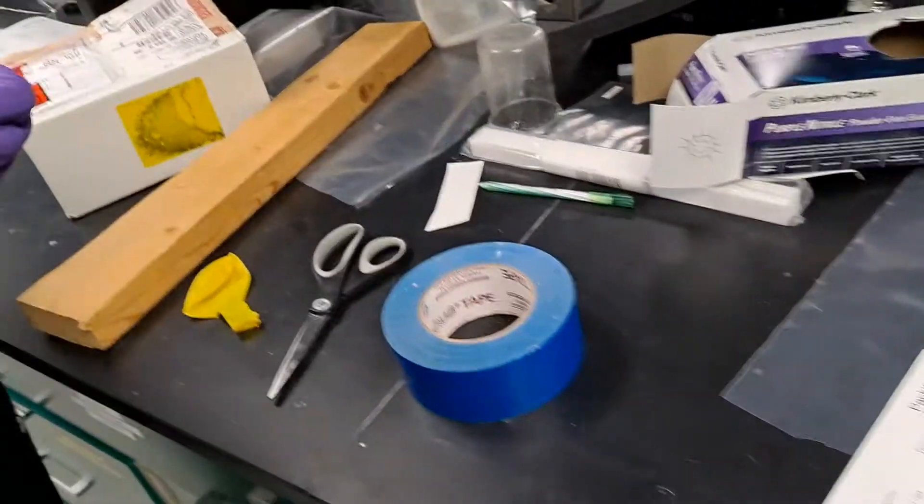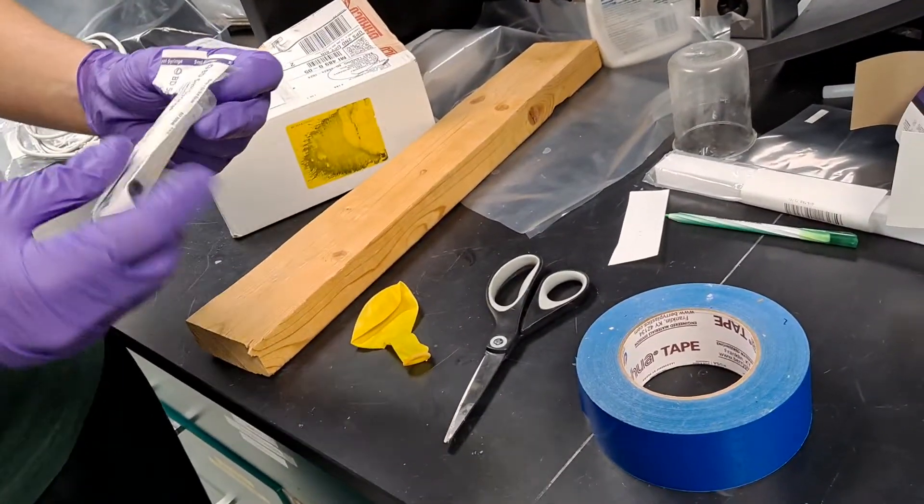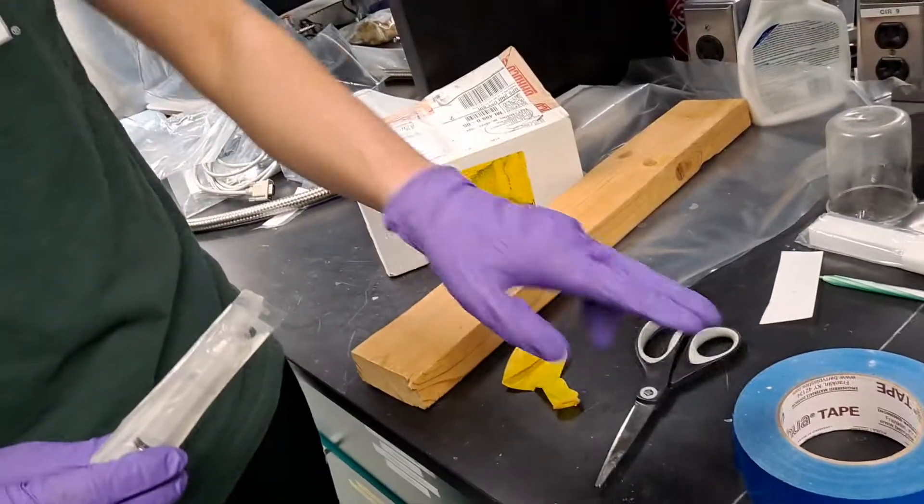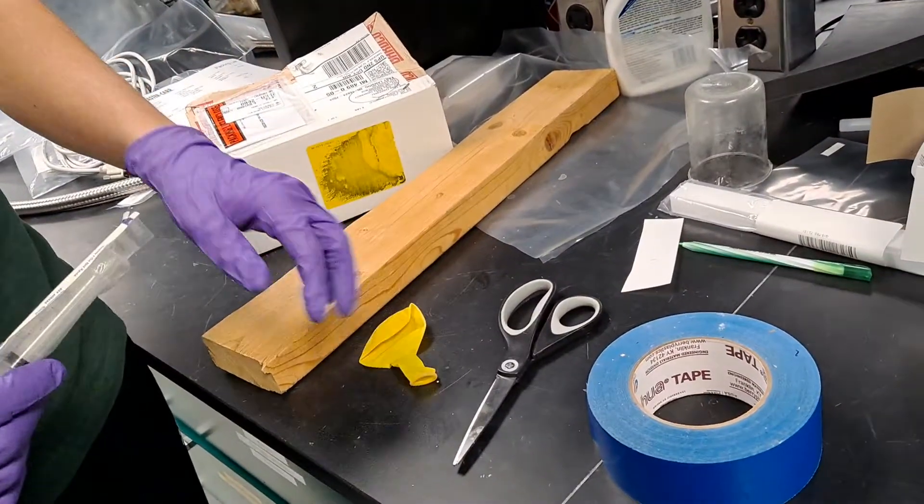I'm going to be going over how to make a nitrogen balloon. You need a 5 mL syringe, duct tape, scissors, and a balloon.